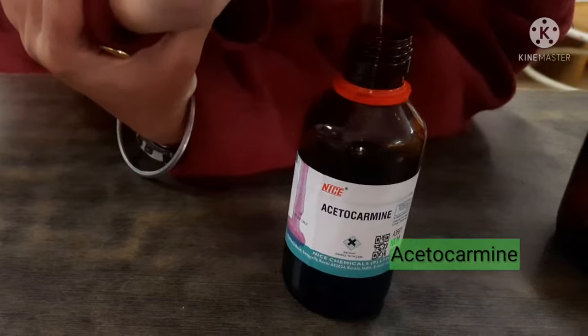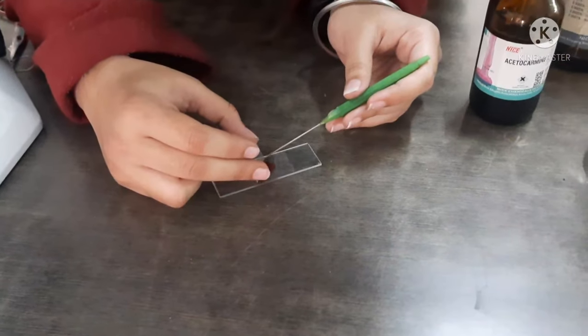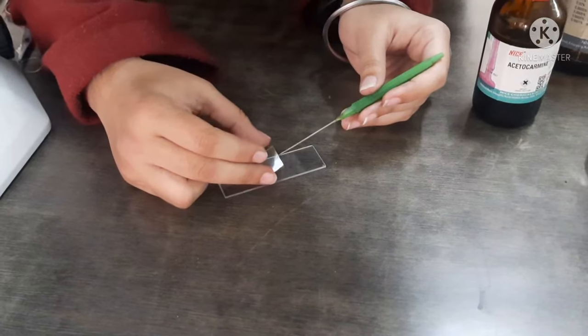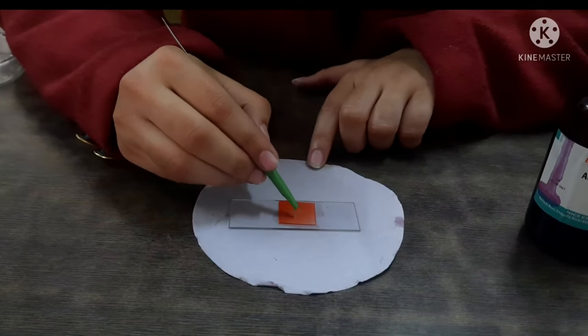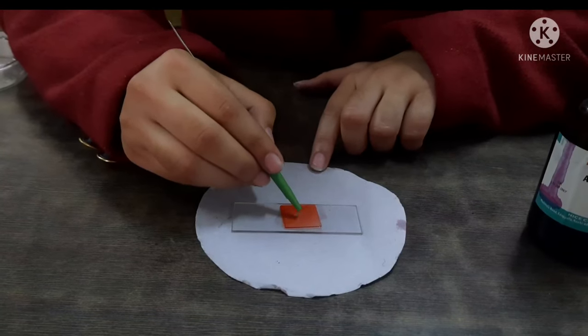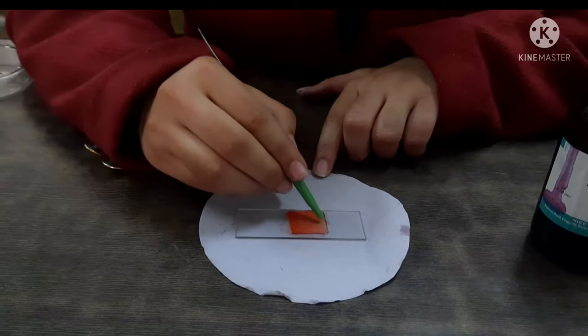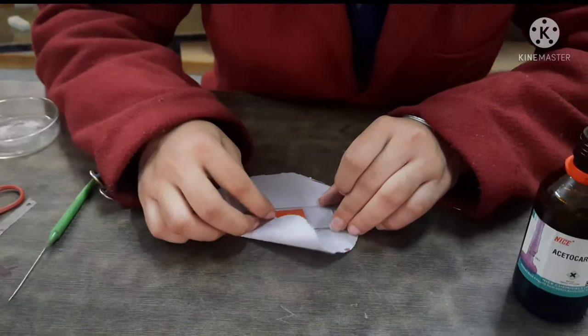Put a drop of acetocarmine on the slide. Place a cover slip with the help of a needle. Gently squash the roots by tapping the cover slip with the blunt end of a pencil or needle until the cells separate and spread out into a very thin layer. Remove extra stain with the help of blotting paper.